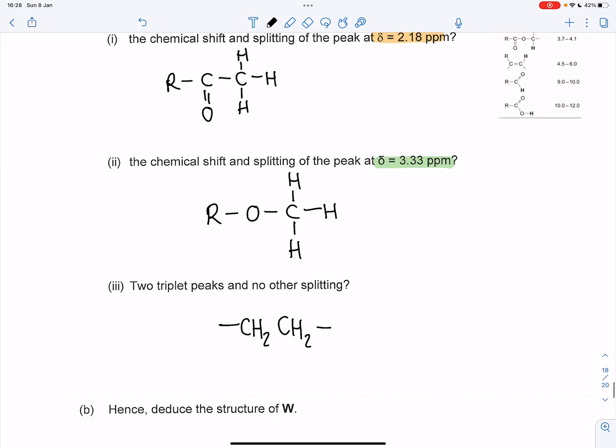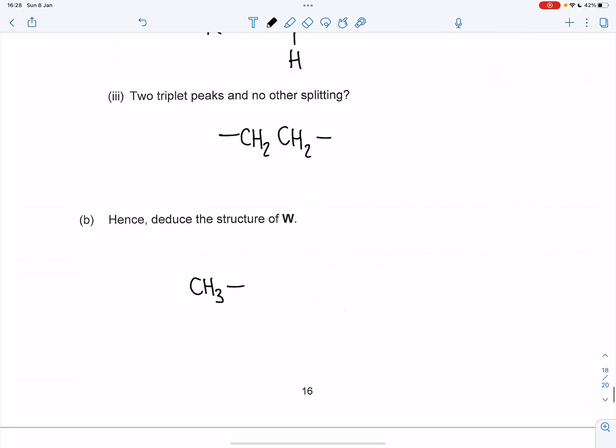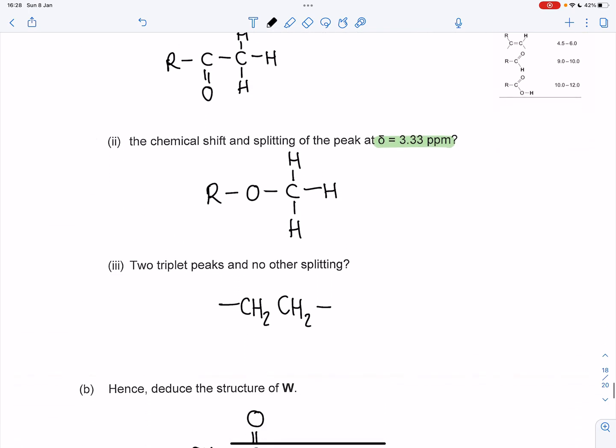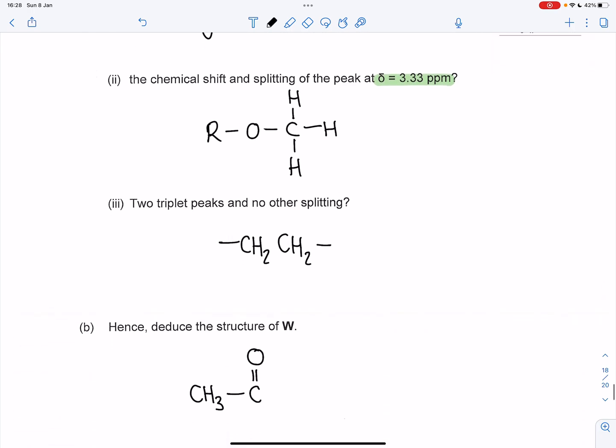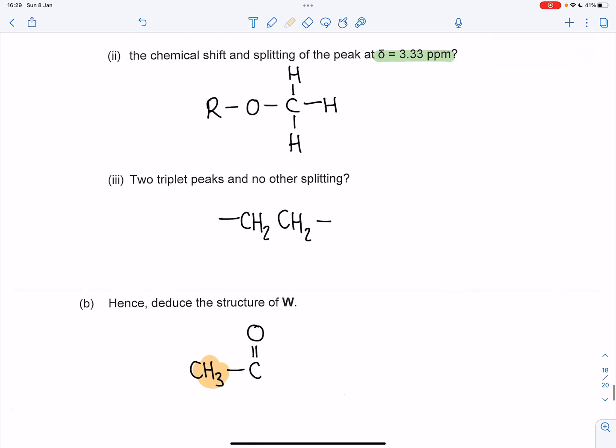And then let's put the pieces together. So remember my tip, CH3s must go at the end. So I'm going to do the CH3 and the C double bond O. And that was our orangey kind of peak from the beginning. I'll just put that in, hang on. That was that one. And then at the other side, I'm going to put the green one.